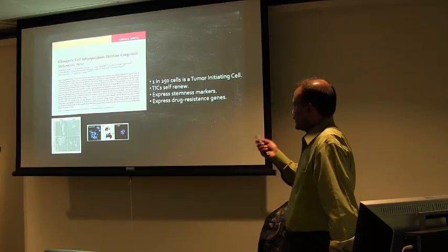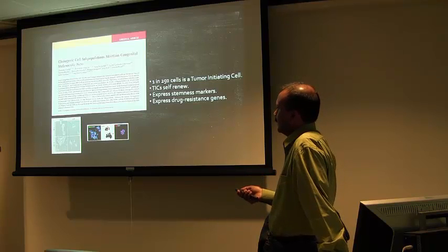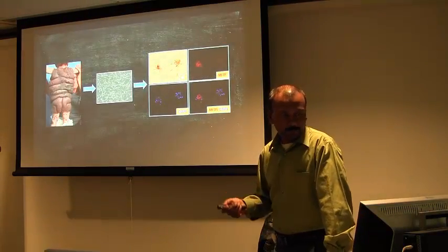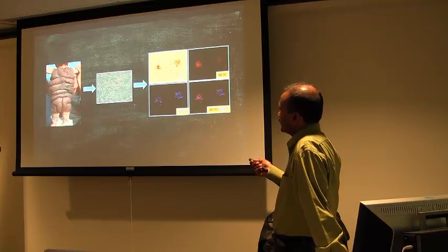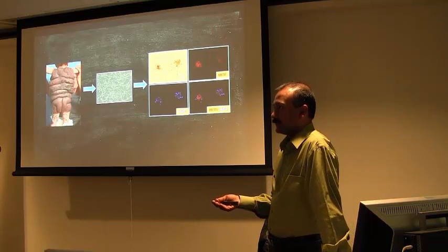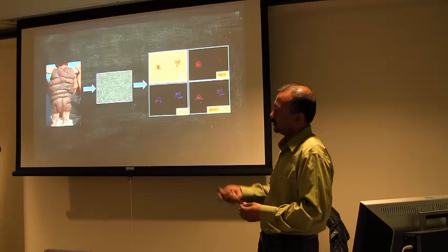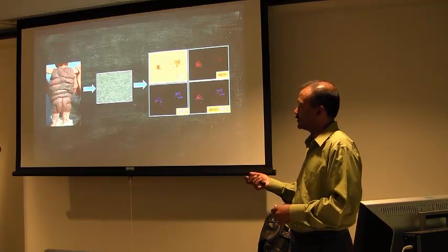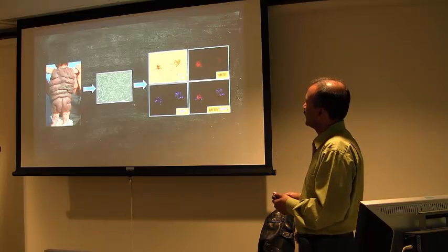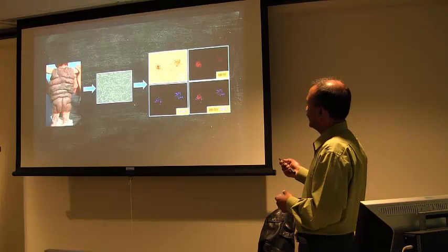So this paper prompted us to think that, okay, if clonogenic cell subpopulations exist in nevi, and the only way to catch those cells is to grow them in spheroids, why don't we grow them in spheroids? So what I did is I cultured some cells from a lesion of this patient. We have an IRB approved protocol of receiving freshly excised tumor tissues from these patients. This patient had undergone surgery in Chicago, not sure which health system, but they shipped us the sample. And we have a tissue repository in the lab that maintains tissues from all these patients.